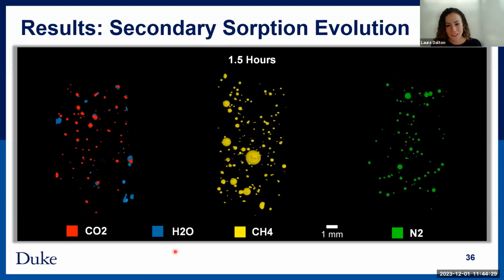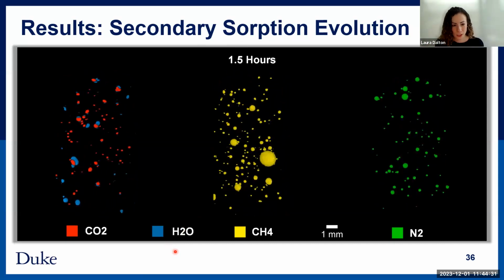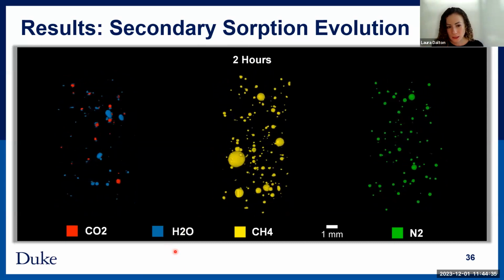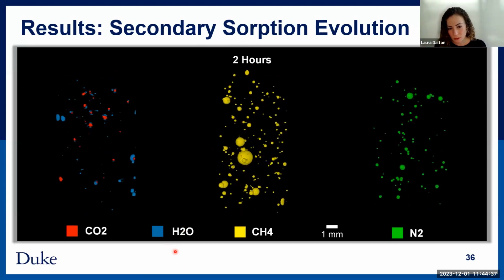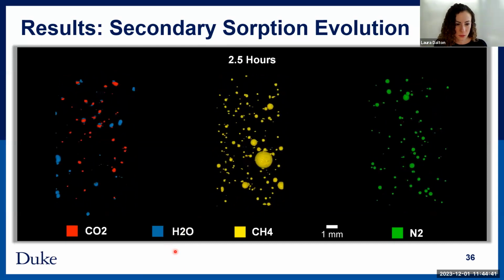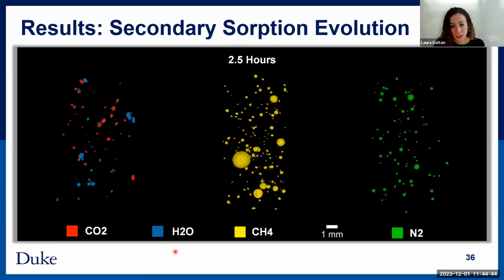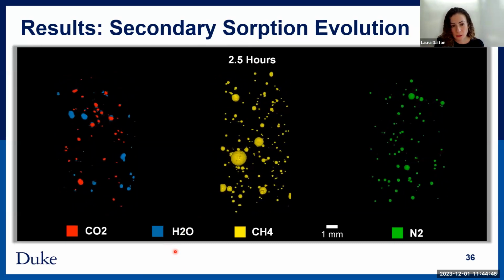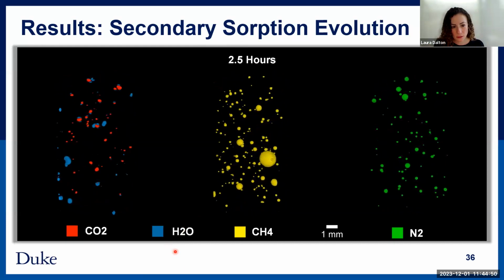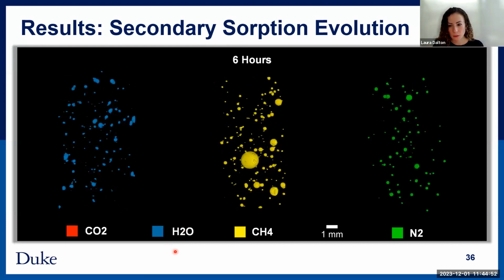It's going to keep rotating. It's just the same sample rotating with time. So we're at 2 hours. Still nothing has happened in nitrogen or methane, but we see that water advancing into CO2 more and more. And actually we get to a point around 6 hours, I think it was 6 hours, where it's just completely saturated the CO2 sample. Yeah, there we go.